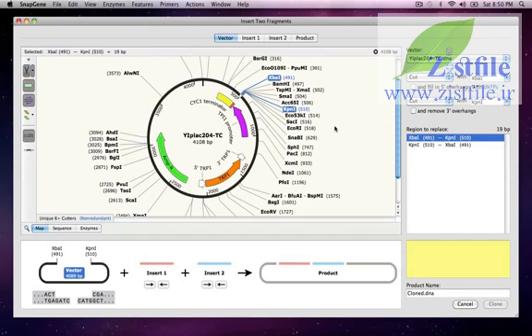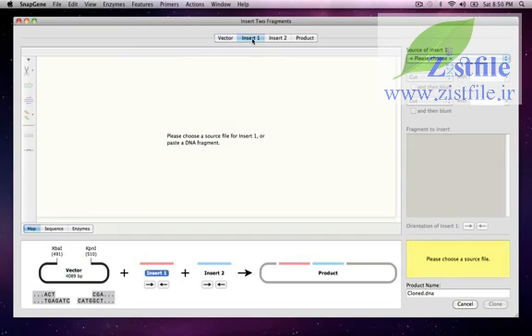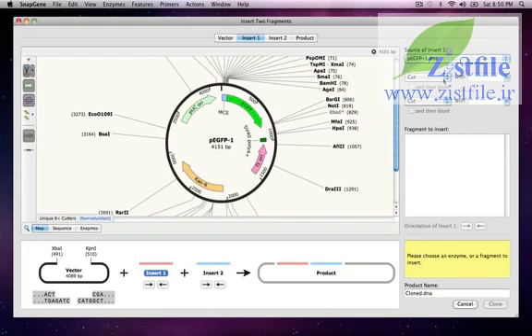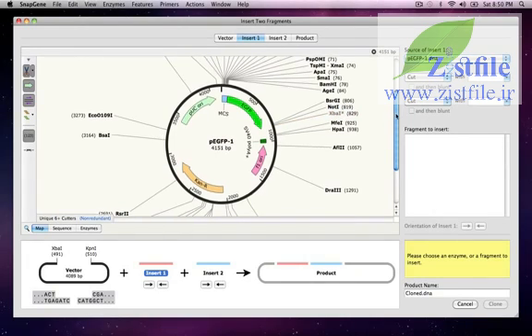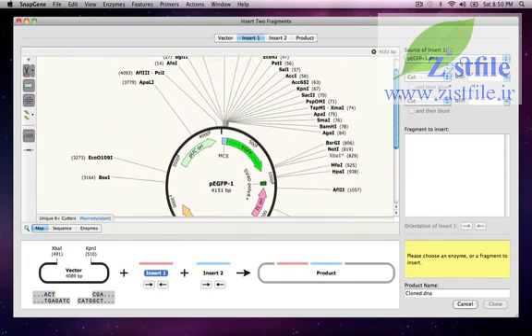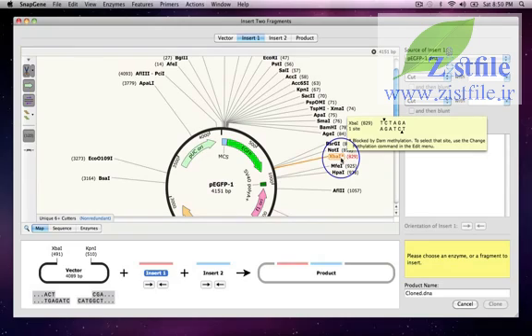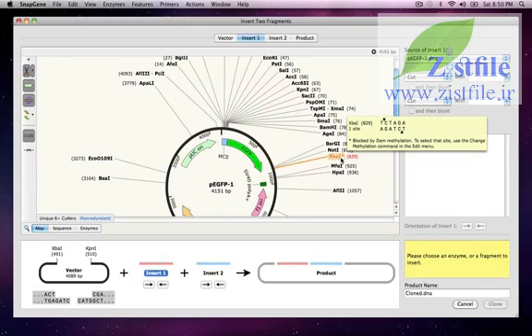Now I'll click on the Insert One tab and then choose PEGFP1 as the source of Insert One. I want to use this XBAR1 site in PEGFP1 for the cloning, but there's a problem because the XBAR1 site is blocked by dam methylation, as indicated by this asterisk, and the gray color. SnapGene is making sure that I won't try an impossible digestion.